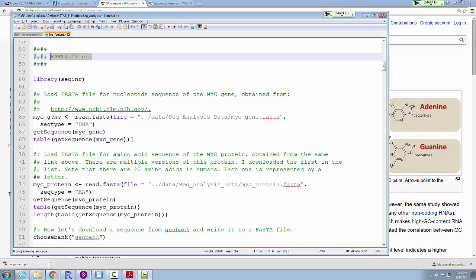file for sequence 1, A, T, A, C, G, and for each one of those letters, a different code. I don't think it's in this FASTA file example, but we'll see it in another one. A different code with a letter corresponds to each of the letters in the sequence, and that codes for confidence or a probability of a correct match, something like that.